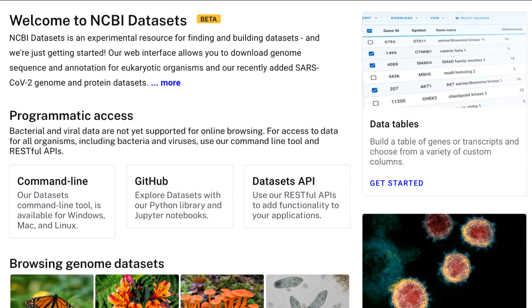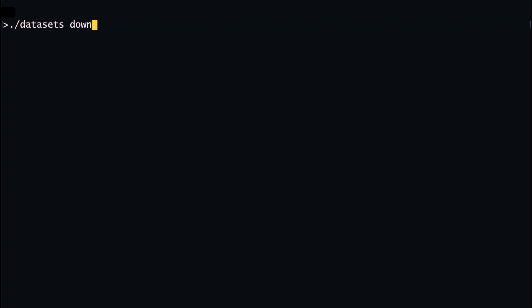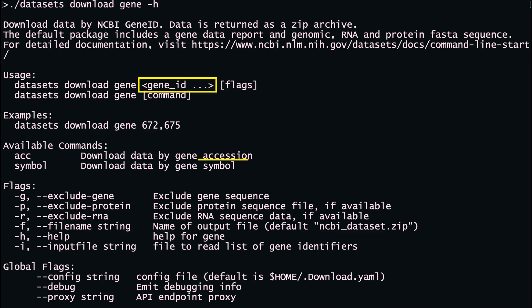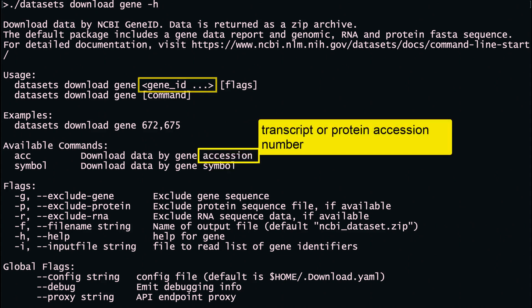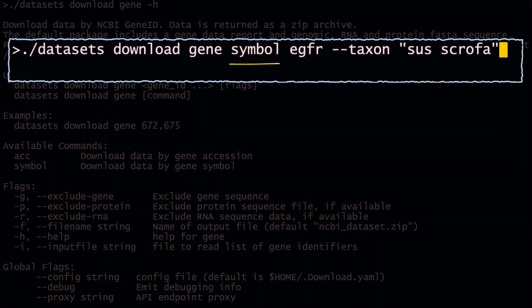Earlier in the video, we showed you the command line download of genome datasets. Let's now use the command line to download gene datasets. Currently, you can retrieve gene data by three different query inputs: Gene ID, Gene Symbol, or Accession. An accession here refers to either a transcript or protein accession number. For organisms other than human, Gene Symbol must be combined with a species name — use the taxon flag.